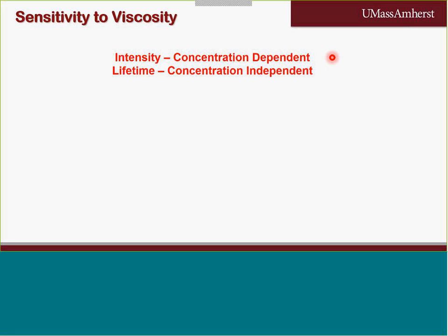So we use lifetime. It is much more difficult to conduct than fluorescence intensity, and that's why it's not regularly conducted, especially for food applications, especially because the requirements of the equipment are also much more complex.